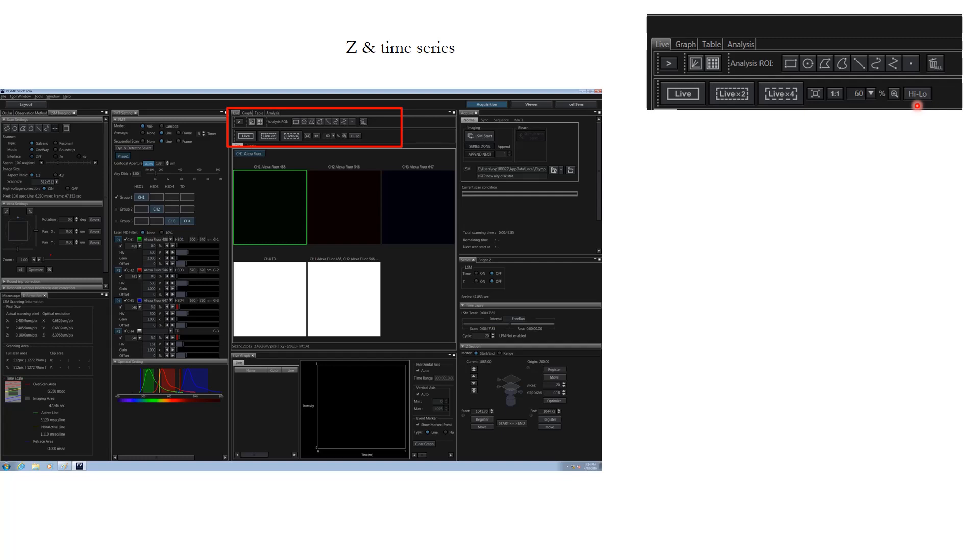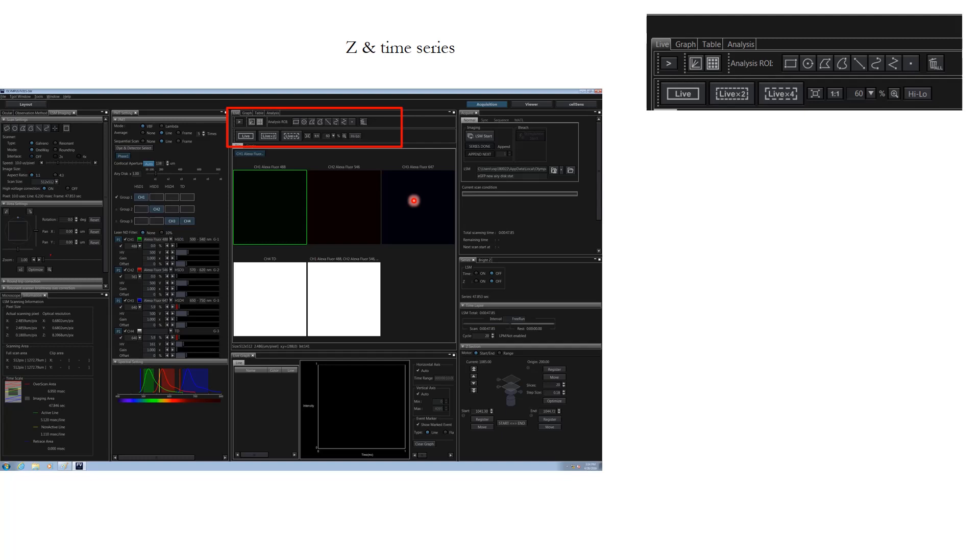I have seen most biologists who end up seeing beautiful images, the green color, the red color, and the blue color. It looks really beautiful but unfortunately it doesn't have the information needed for doing quantitative imaging. If you have a lot of background signal and a lot of saturated pixels, you will be having a bad quality image which is not very worthwhile for use in quantitative imaging.